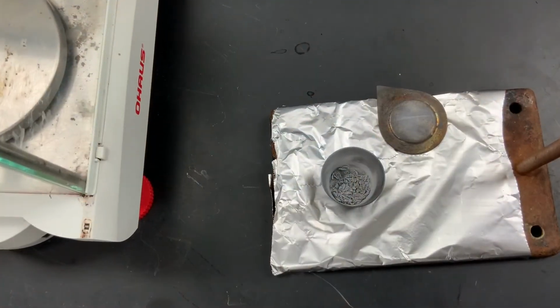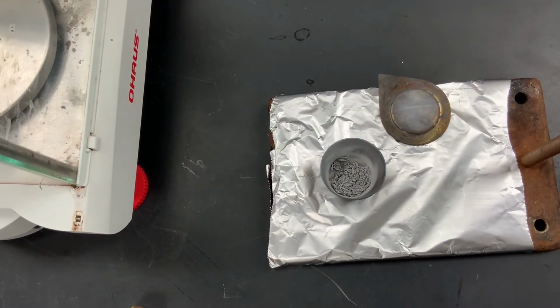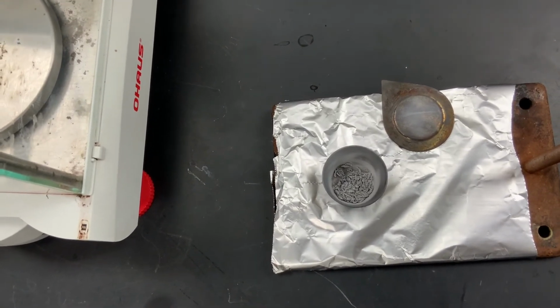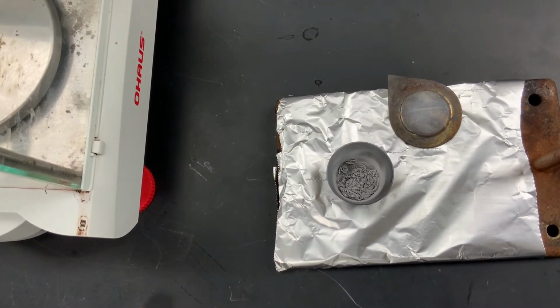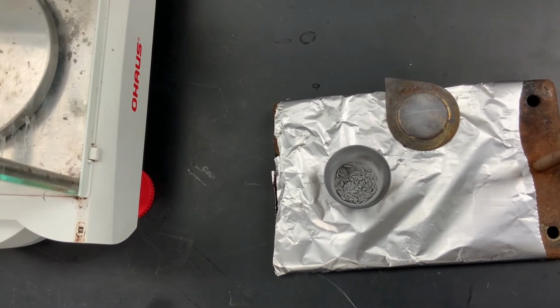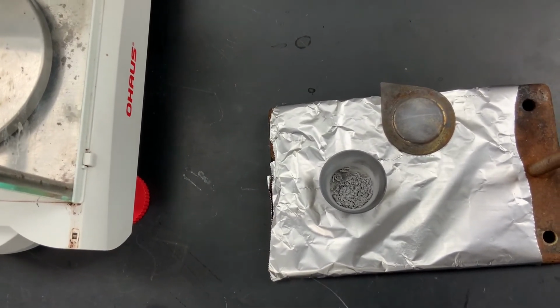All right, guys, we got about the halfway point of turning the magnesium into magnesium oxide. It's been on the heat for about 5 minutes. Now we're letting it rest for a little bit. We're going to stir it up so it all gets evenly heated. We'll put it back on the Bunsen and continue to heat.